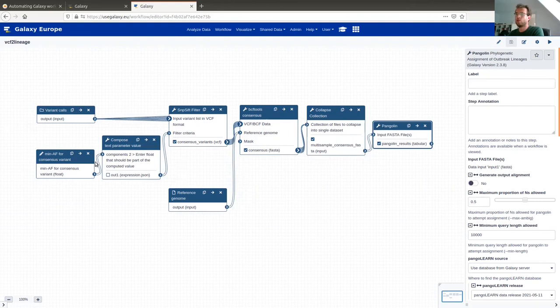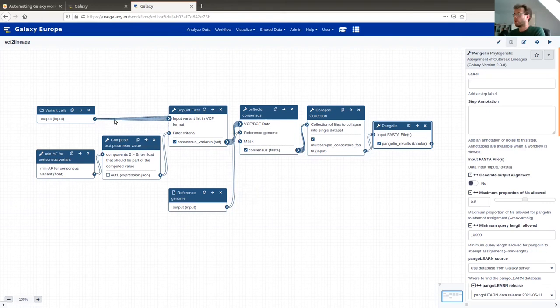That's a brief introduction to the workflow — there's more information in the training material if you're interested in the scientific background. With that, the tutorial is over. Good luck implementing the bot for the VCF-to-lineage workflow.